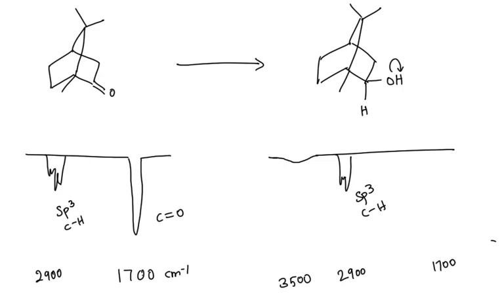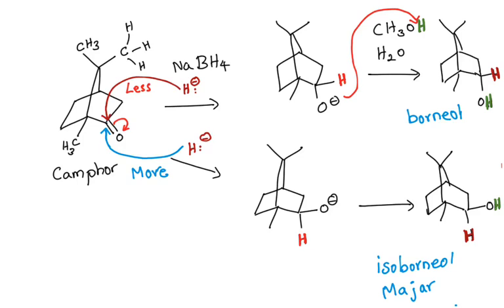Now the NMR spectroscopy. In the NMR spectroscopy, you are looking for this proton. Yeah, these two protons in the NMR spectroscopy.